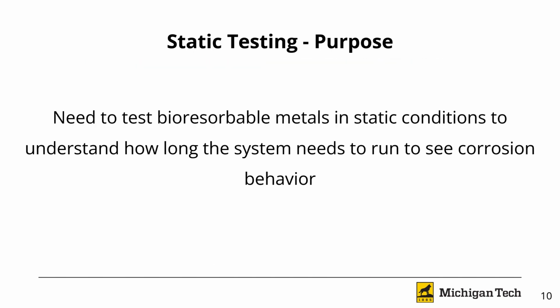We performed static immersion testing on the bioresorbable stent wire segments that are intended for future use in degradable stents. This testing was designed to provide baseline corrosion data and to help the team understand how long the dynamic system needs to run to begin to see corrosion activity.